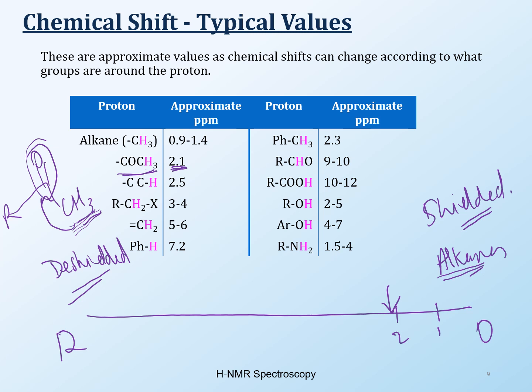But the thing is that what I'm trying to tell you is that it shifted. This CH3 is not the same as that CH3, okay, because of that oxygen, and it caused the deshielding to happen, and so the methyl group shifted here. Okay, that's what happened. So this is the kind of thing that happens in NMR: these protons, which you would think, oh, these are all the methyl protons, CH3s, they should all come around 1. No, they cannot all come around 1 because they're exposed to different environments. Okay, they have deshielding and shielding going on.